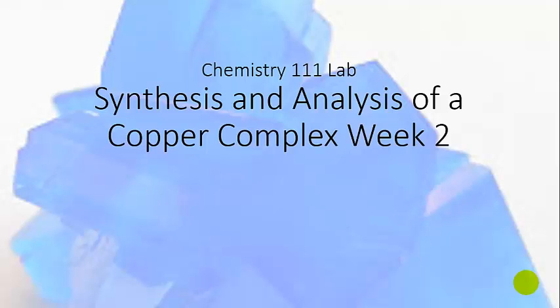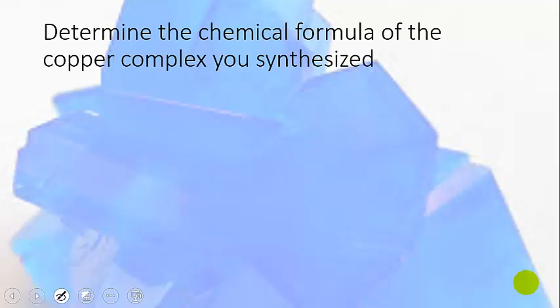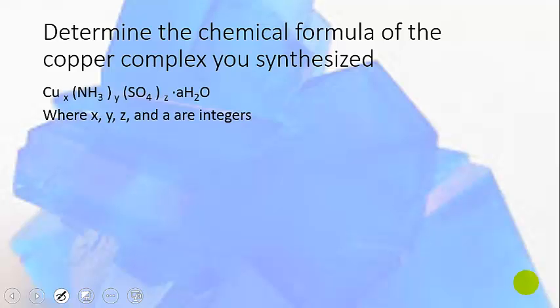This is the pre-lab video for the second week of the copper complex lab for Chem 111. Recall that we are determining the chemical formula of the product that you synthesized last week. And the basic formula for that is copper.